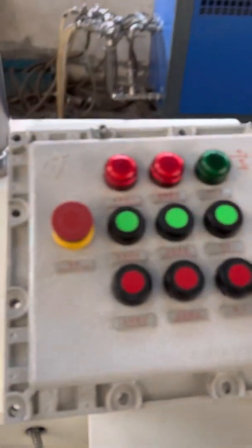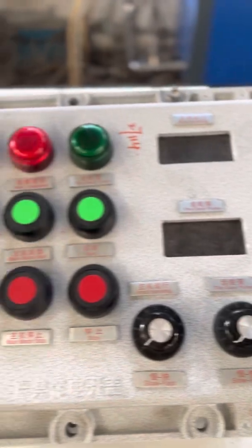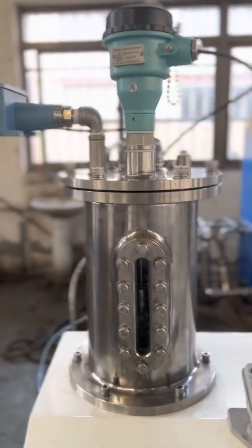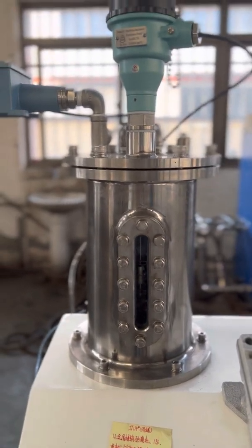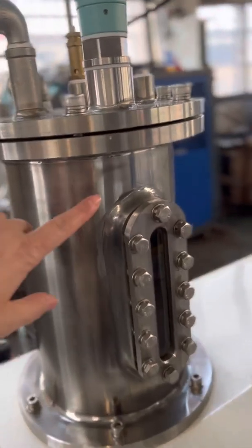Here is the electrical control panel. You can see it is explosion-proof. And this one is the cooling tank for the mechanical seal. Inside is the cooling water.